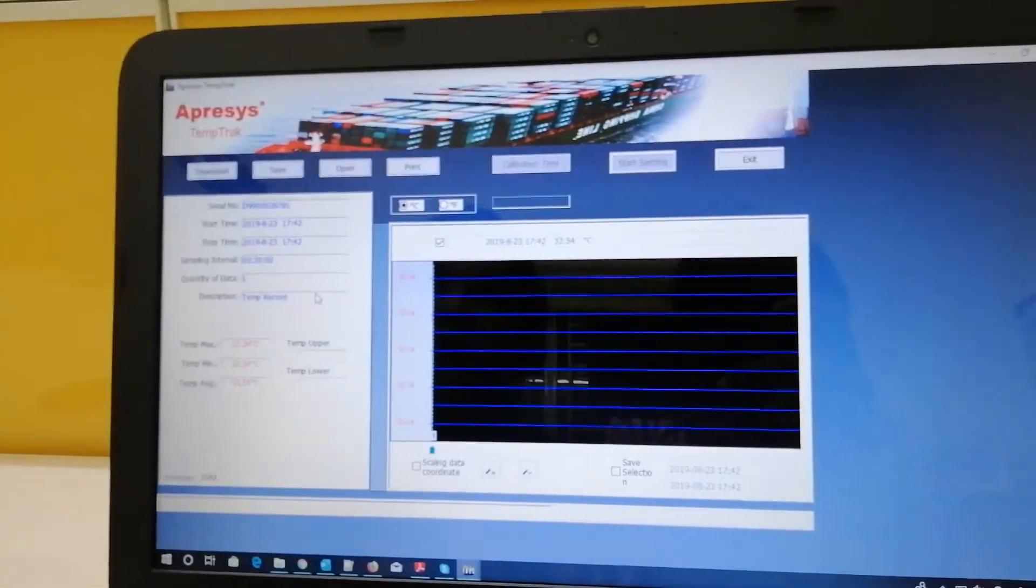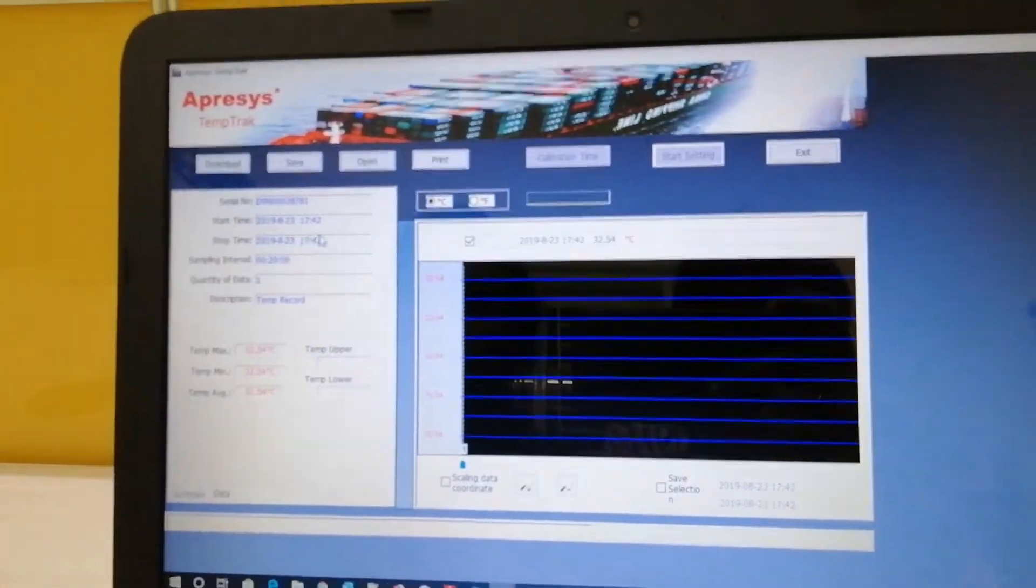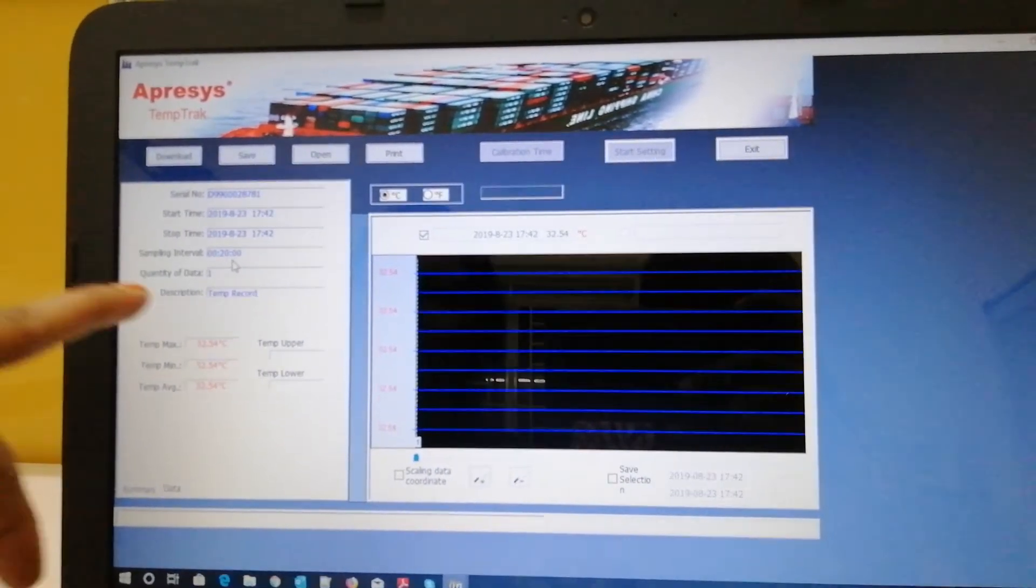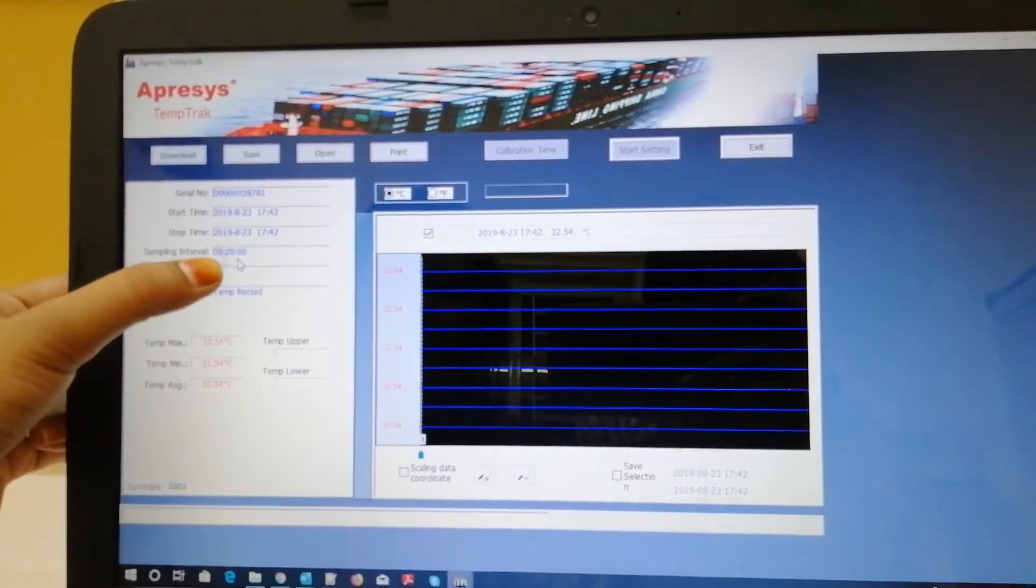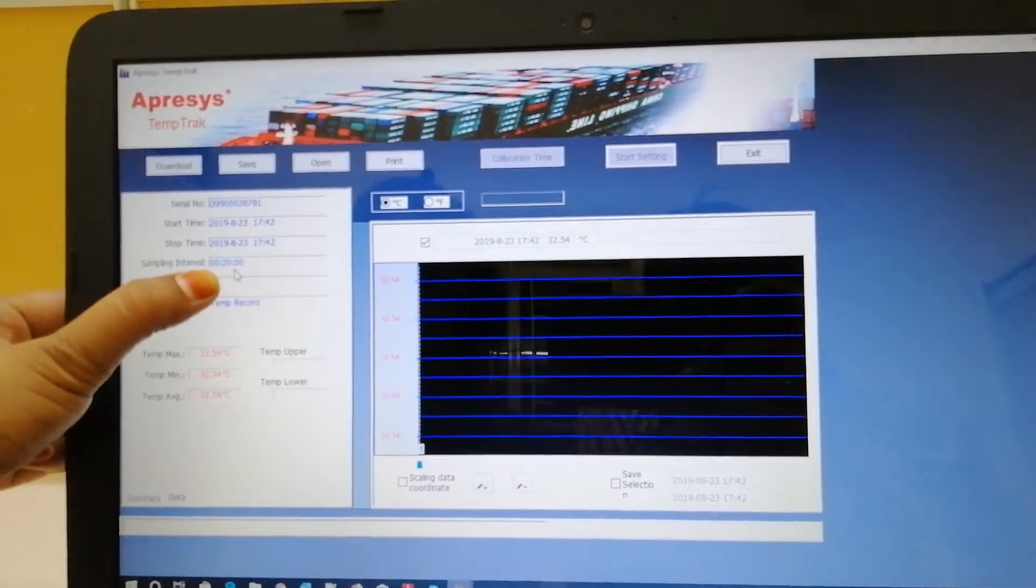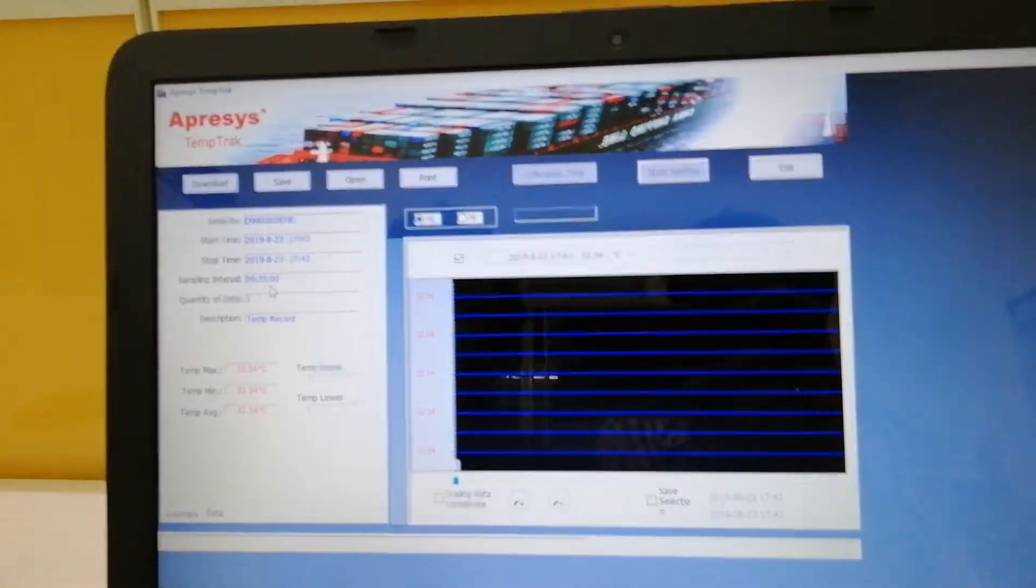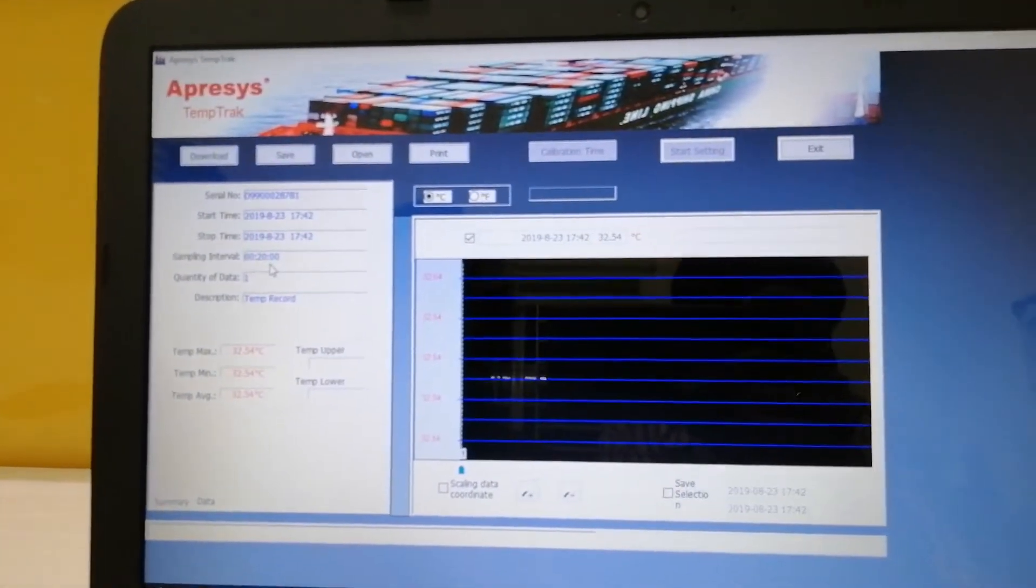These are the parameters: serial number, start time, stop time, and sampling interval, which is non-editable and fixed. For D99, it is 20 minutes. For D25 and D50, the sampling interval will be different.